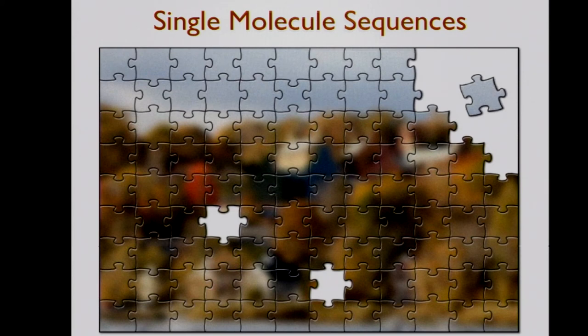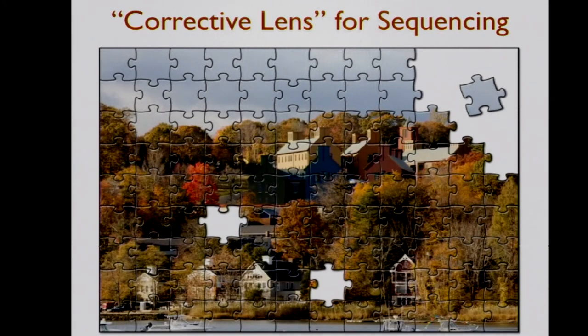When we first got these data, we were really struggling to make sense of them. The thing that we have now, though, is automated algorithms that can take these fuzzy pictures and sharpen them up. It's like in Photoshop, we hit the sharpen button to try to resolve the picture. So now suddenly we have nice sharp pictures, nice and large, with clear resolution of what's going on.